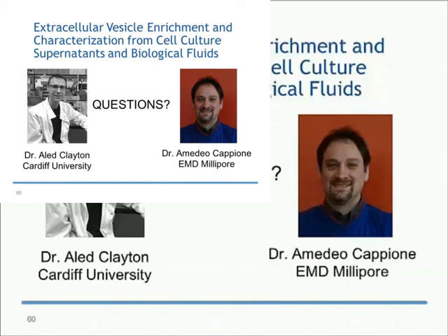All right. We're actually up to an hour, but there's still a good number of great questions here. So if the two presenters are up for another 5 or maybe 10 minutes, sure. I'd like to continue with that to cover as many questions as we can. So next is, do you think that the affinity capture method might change the functions of the exosome?